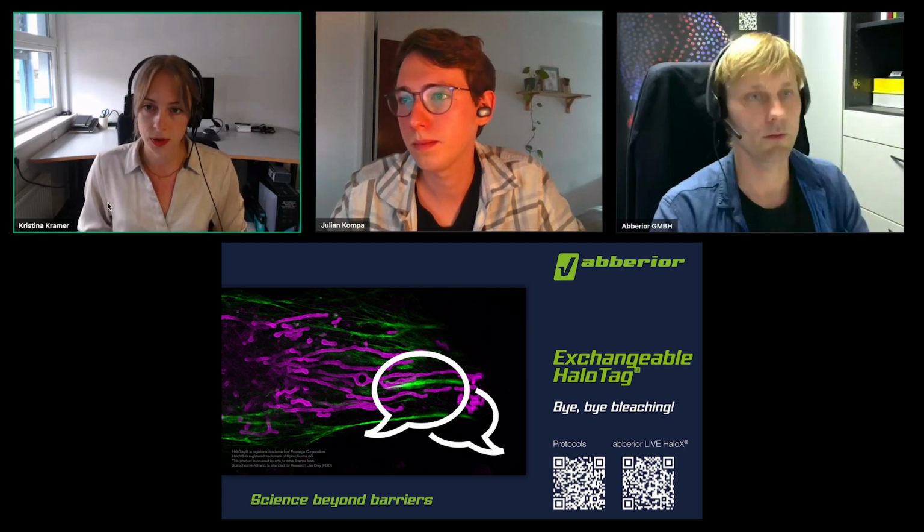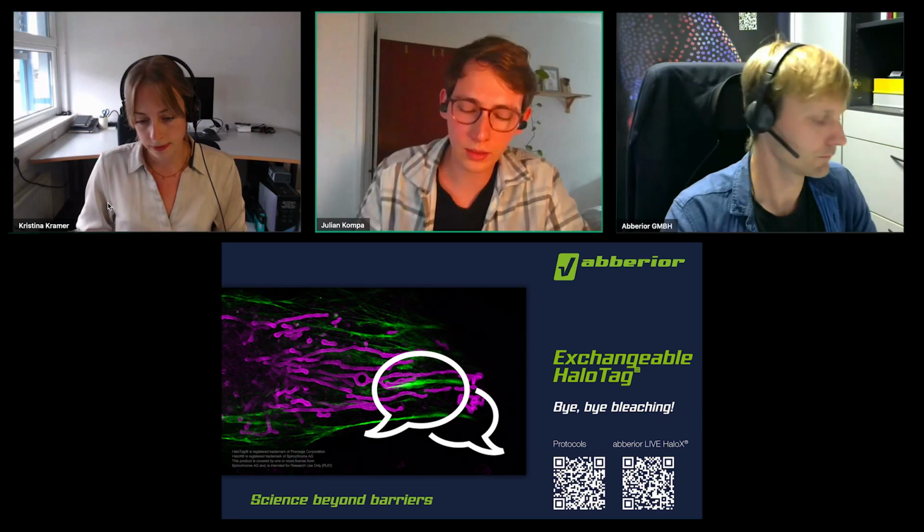Thank you. Another question to Julian. So you also talked a bit about HaloTag proteins for PAINT microscopy, and there was one question concerning the fluorogenicity and whether this is compatible with methods like PAINT, and maybe also in this context, what makes HaloTag-based PAINT attractive compared to DNA-PAINT? Yeah, also a great question. So sure, the XHGLs are fluorogenic, and as we showed, they can be used for PAINT and MINFLUX, and certainly the fluorogenicity will help to suppress background signal from the unbound fluorophores.